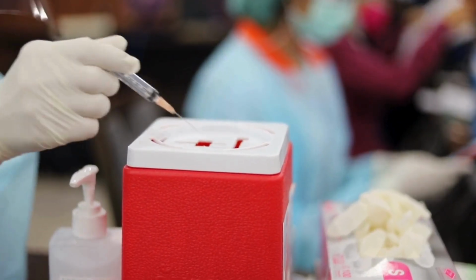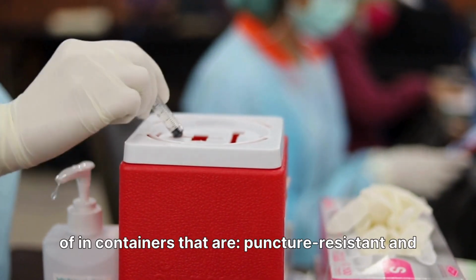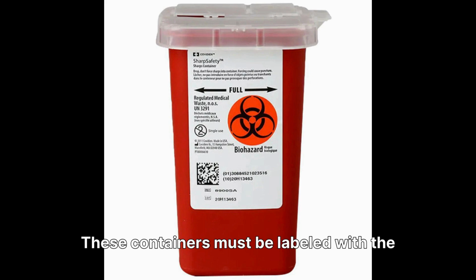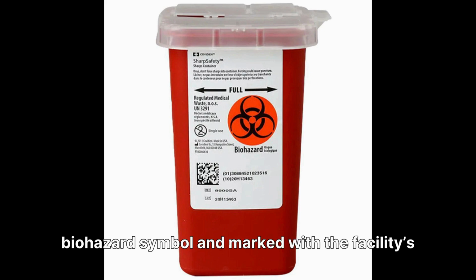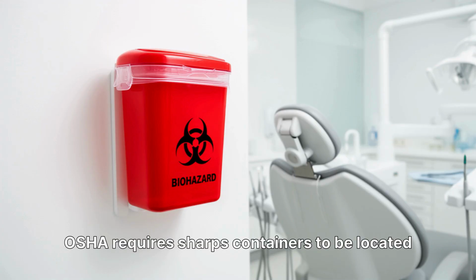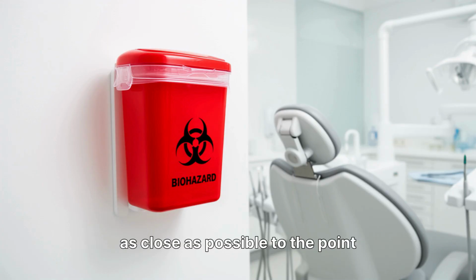Sharps containers. Sharps such as needles must be disposed of in containers that are puncture-resistant and labeled. These containers must be labeled with the biohazard symbol and marked with the facility's name and address. OSHA requires sharps containers to be located as close as possible to the point of use.